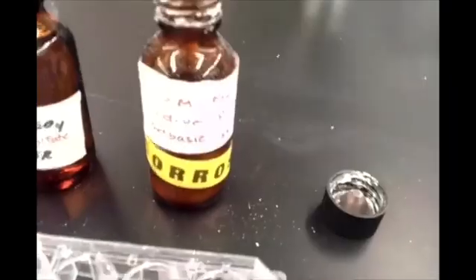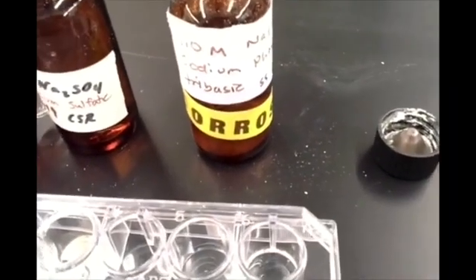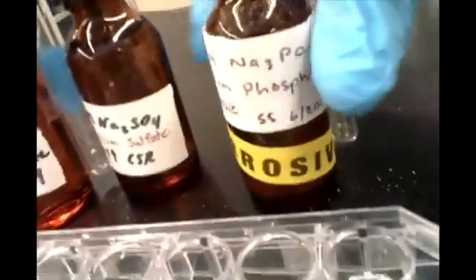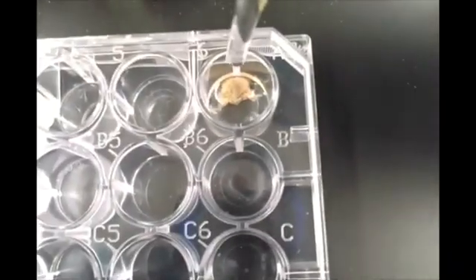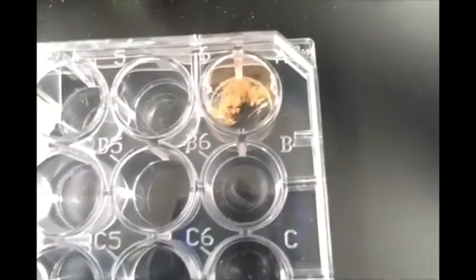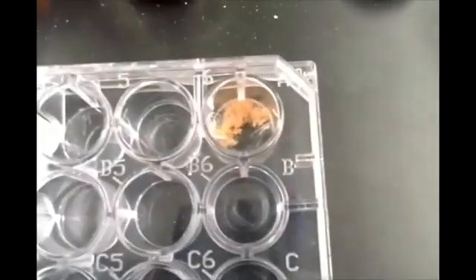Alright, our third trial involving silver nitrate involves us adding some sodium phosphate to that. So let's go ahead and add that to this third cell over here. Okay, and hopefully that should be pretty clear as well.